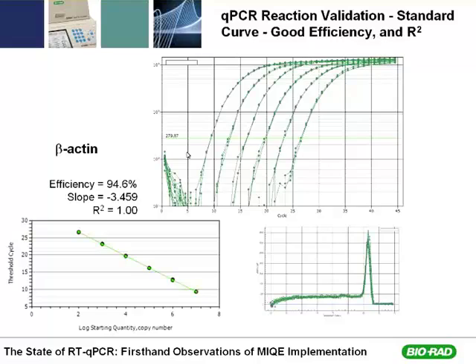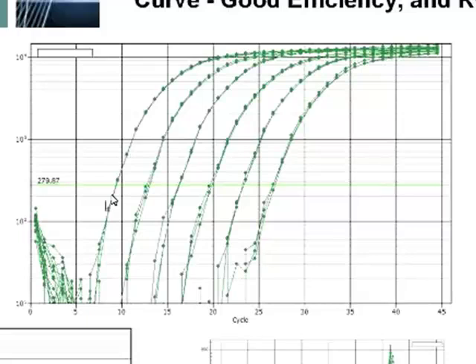At that annealing temperature, you need to test by running a standard curve, which is a serial dilution series of that same pooled diluted cDNA sample. So you're going to dilute the cDNA sample in a serial dilution series, okay? And I would recommend that the full dilution you use is primer dependent. So if your primers are low expressing primers, they come up above, let's say, 25 CTs, I would recommend using a 2-fold serial dilution series for the standard curve.